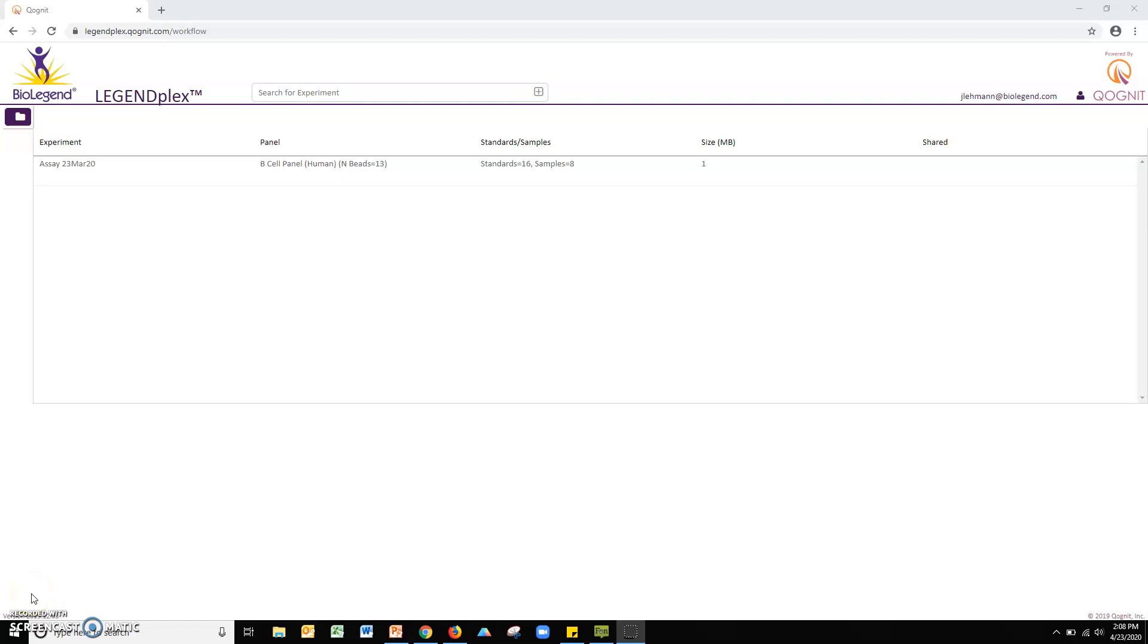Welcome to the video tutorial for BioLegend's cloud-based LegendPlex data analysis software. In this video, we will be showing you how to perform the basic steps needed to analyze a LegendPlex data set. Please note, users are strongly encouraged to read the entire software manual for a complete explanation of all program features.